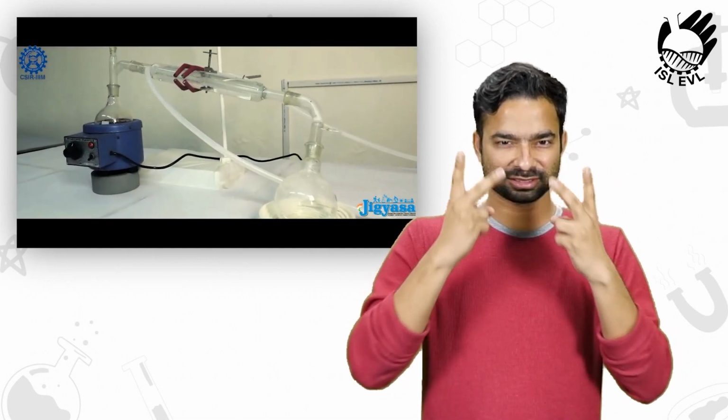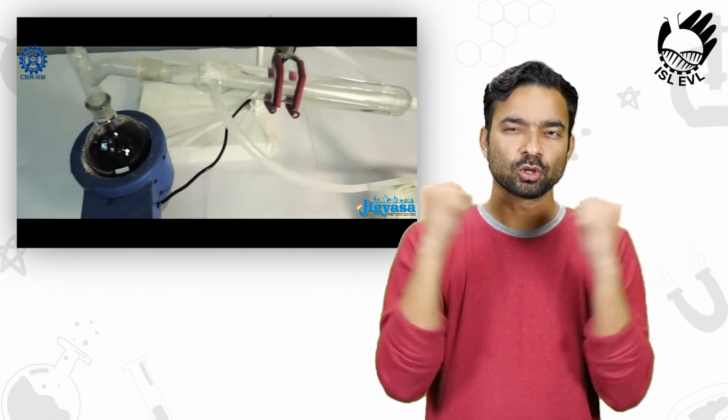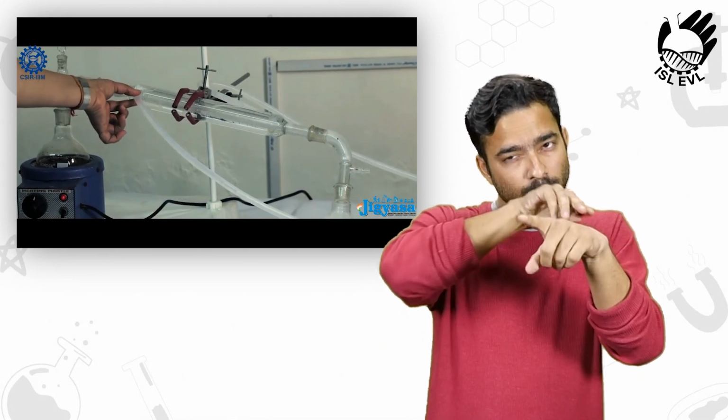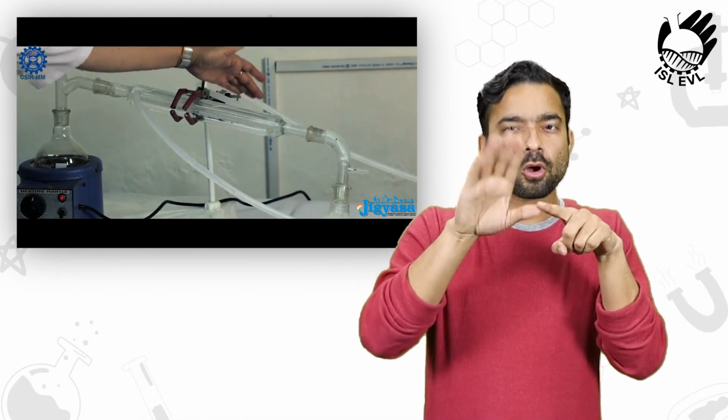Have you seen the distillation unit? Let's see. This is the distillation unit. We are going to distill water. Here is the tap water. This is the condenser. The water evaporates. You can see the vapor which is going in the condenser. This is the inlet by which the water is being cooled. This is the outlet. The pure water is being collected in the RB.